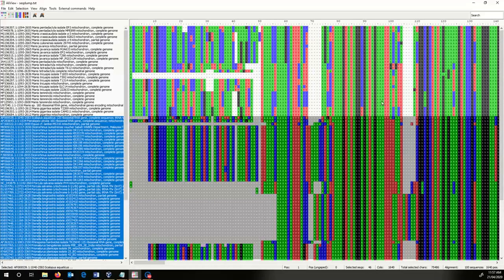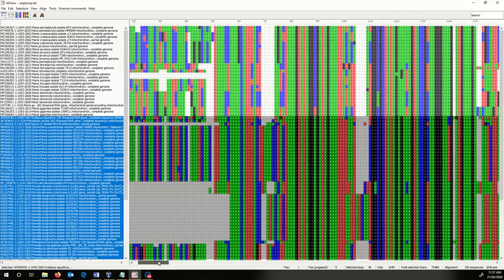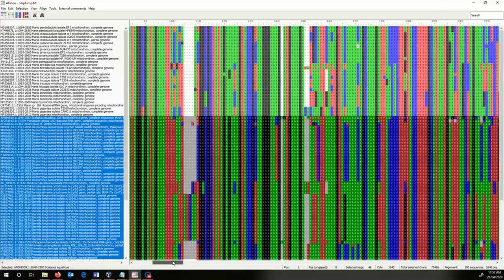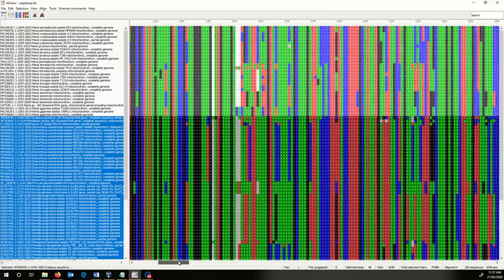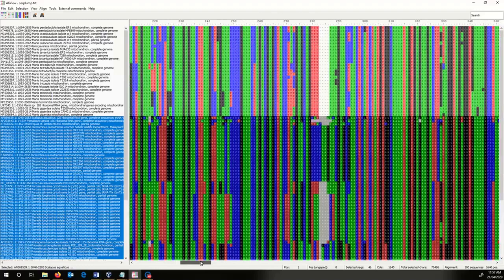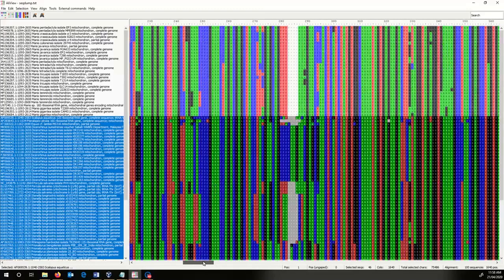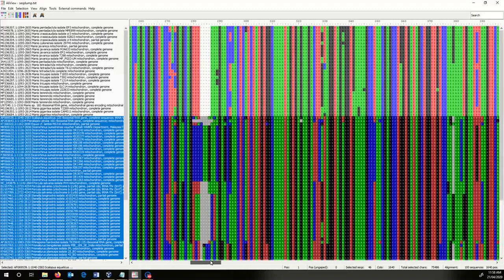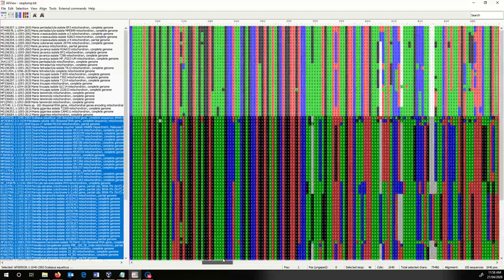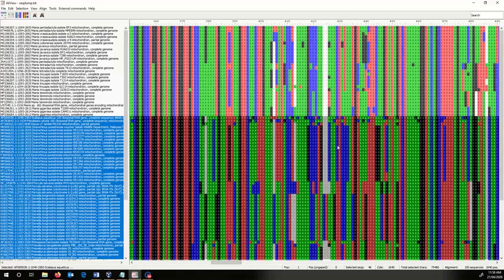We can go through the pangolins and find places where we might put good PCR primers. What we want is two bits of DNA that are consistent within pangolins, but not present in, or not perfectly present in, non-pangolins, and that have a variable bit of DNA between them that we could use to identify pangolin species. So maybe a good thing to do is to look for a variable bit.